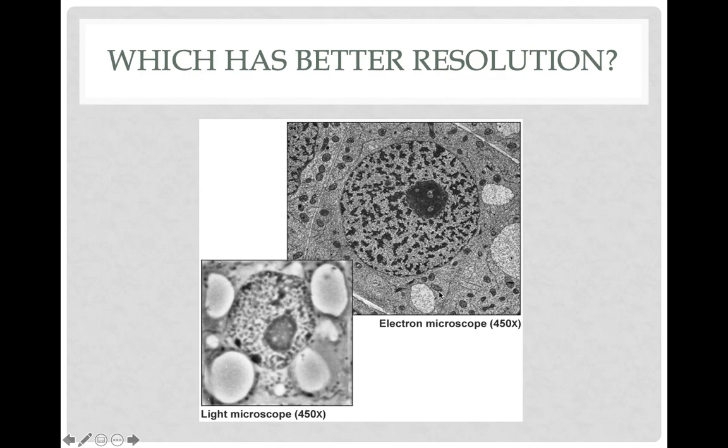Really good details. You can see kind of even inside of the little mitochondria and things inside of the cell, which is pretty cool. Whereas over here, you just can't. It's just kind of a blurry blob. You can't really tell what you're looking at. So sometimes you need microscopes that take really good pictures when you want to see things inside the cells, and sometimes you don't. You just need to see what they look like, what shape they are, so you can tell that's round. Different types of microscopes have different resolution power, and whatever you need to know from your research or whatever you need to define from the hospital, you'll have the microscopes that are best used for that, probably available for you already.